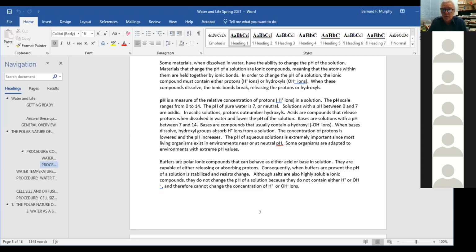You drop a fraction of a pH rather than several pH units. So it minimizes the change. And same thing with sodium hydroxide. You have a beaker full of distilled water, you put in a drop of sodium hydroxide, boom, up to pH 10 or something.